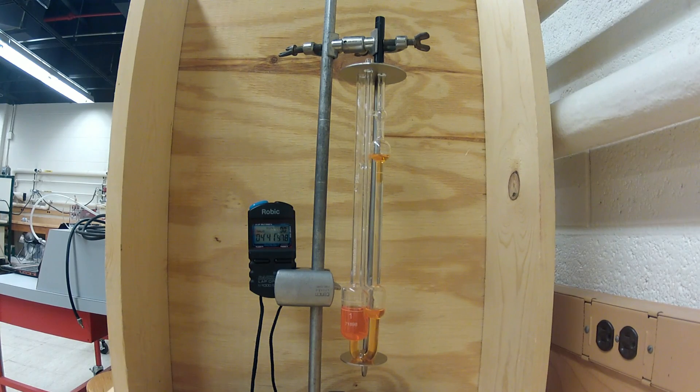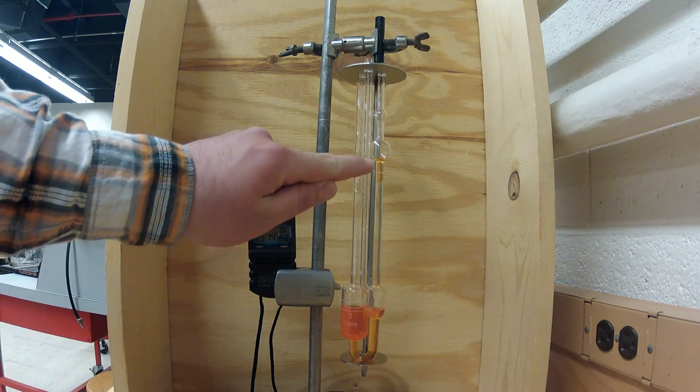The video has been time-lapsed towards the end of the procedure for the sake of brevity. The time it takes for the fluid to fall can range anywhere from 3 to 6 minutes depending on what test fluid you have. In this case, the time is around 5 minutes. You'll want to stop the timer once the bottom of the fluid meniscus has crossed line M2, shown here.